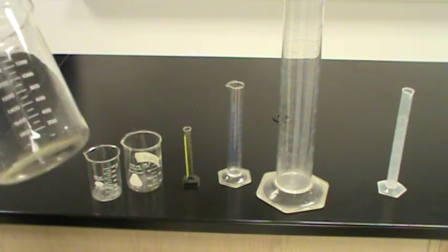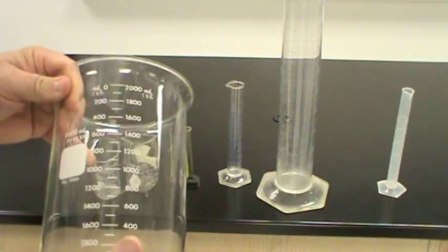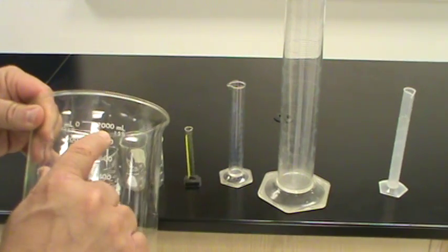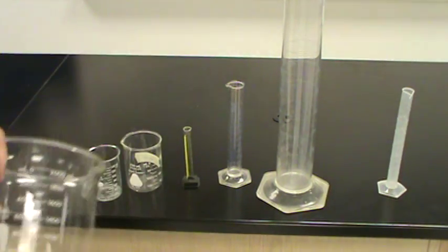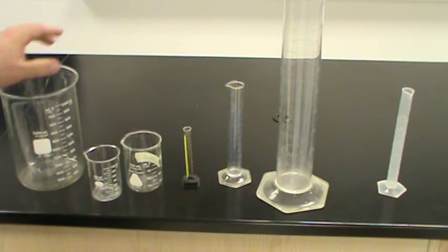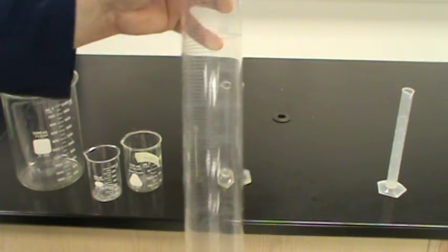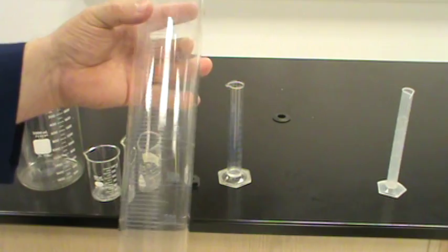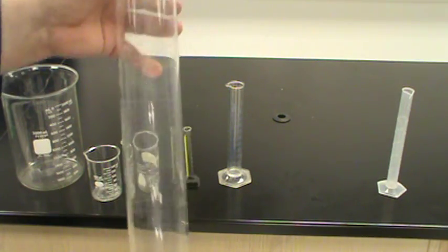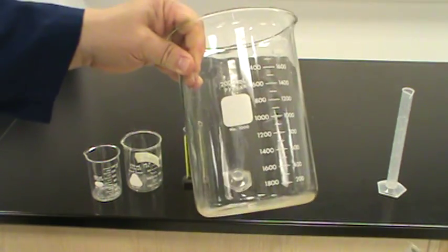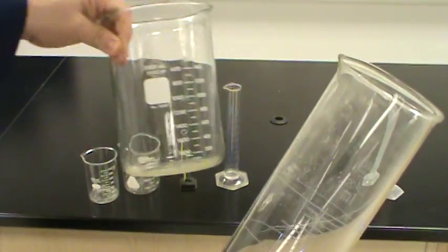The first thing that I have for my students is you need to know what size we're working with. In this case, this is a 2000 milliliter or a two liter container. This is a 1000 milliliter or one liter container. So this, even though it looks larger, only holds half of what this does. And actually let's prove that to you right now.